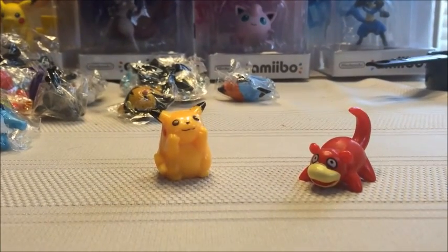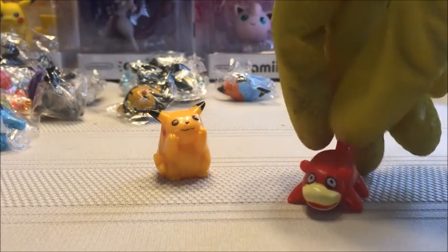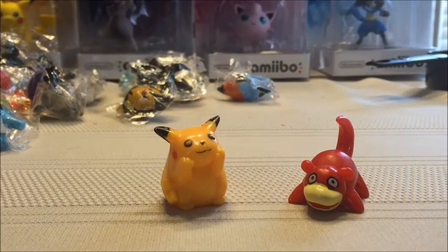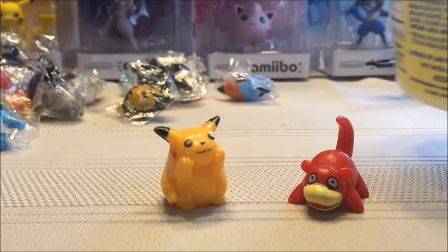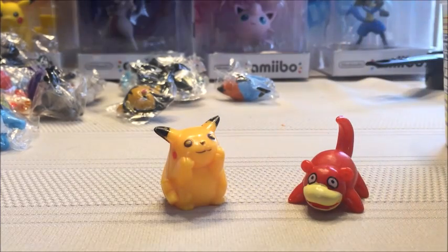As promised in a previous video, I was going to do a cadmium test on some knockoff Pokémon figures. I have a solution here which doesn't test how much cadmium — it just tests if there is any present at all. I've already mixed the solution so you didn't have to wait five minutes for me to do that.